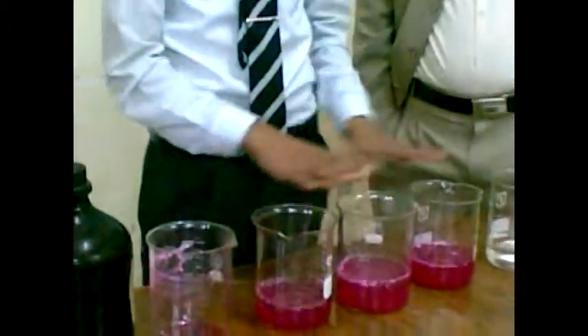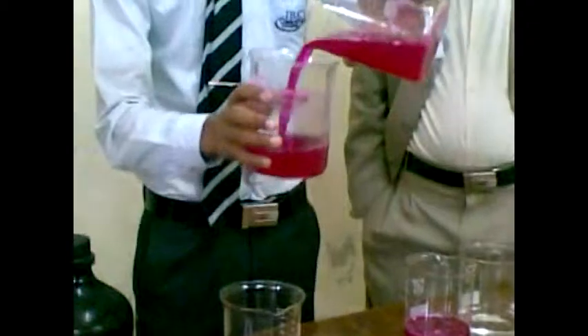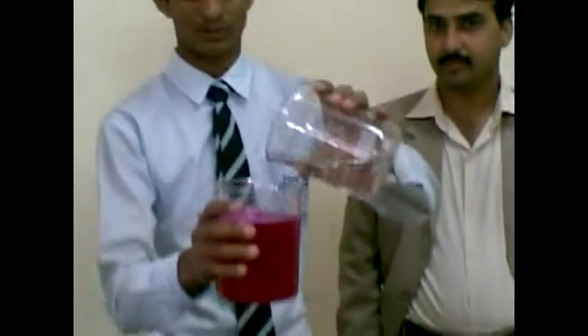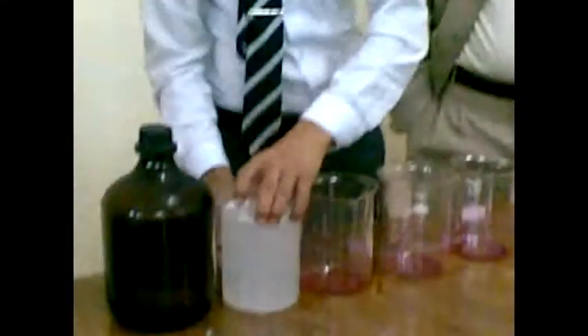Now I again return all the liquid into this beaker. Now it is the acetic acid — it has the property to remove all the color. You can observe the color of water changes back to the same position. It removes all the color, used for this color-changing experiment.